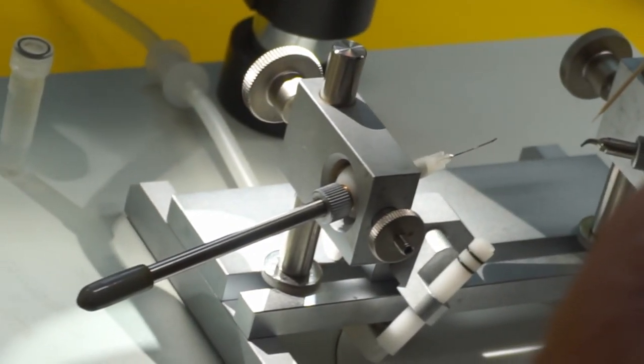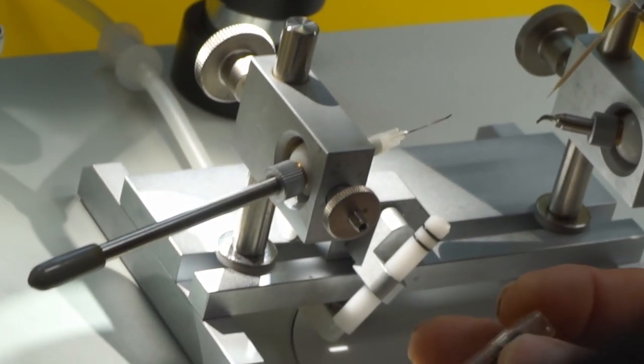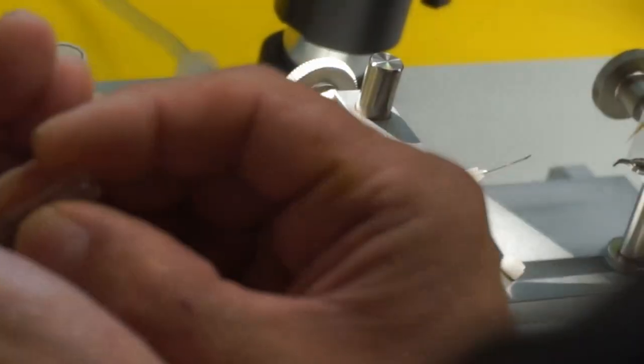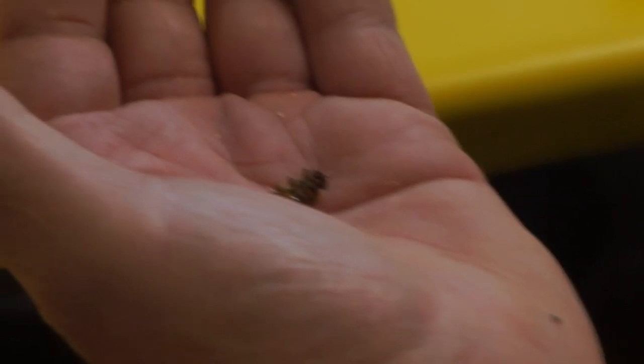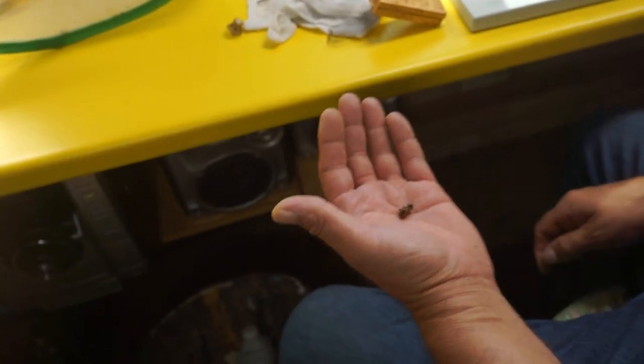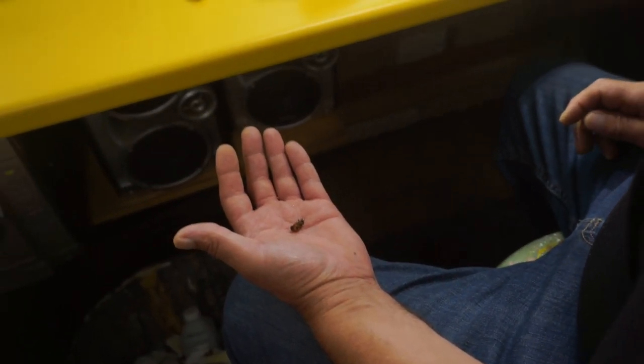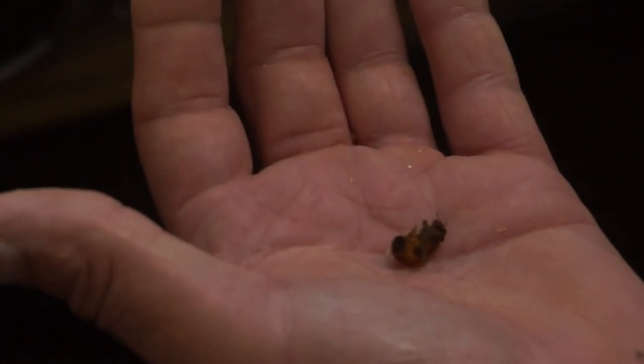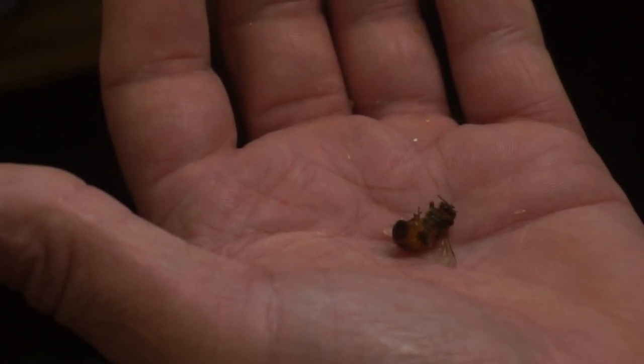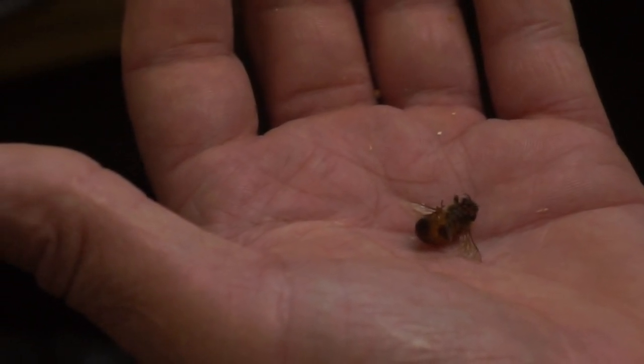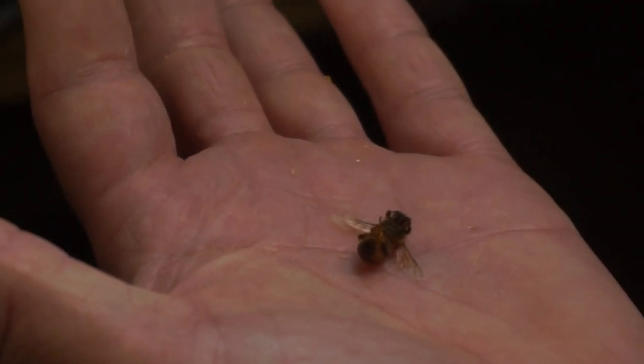Now I was reading that, curling out that abdomen, like no way you're coming near me with that thing. She fainted. You ever see a queen faint? No. Oh yeah. From the CO2? No, just from shock. He hasn't CO2'd her yet.